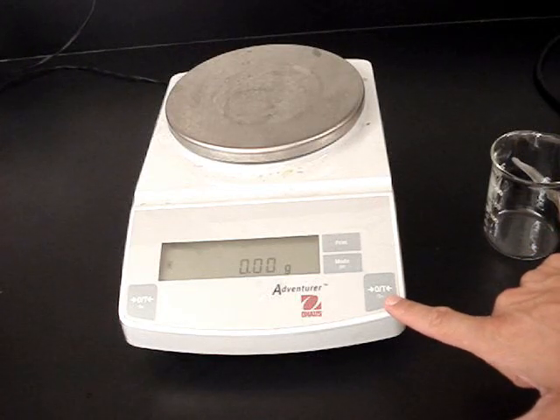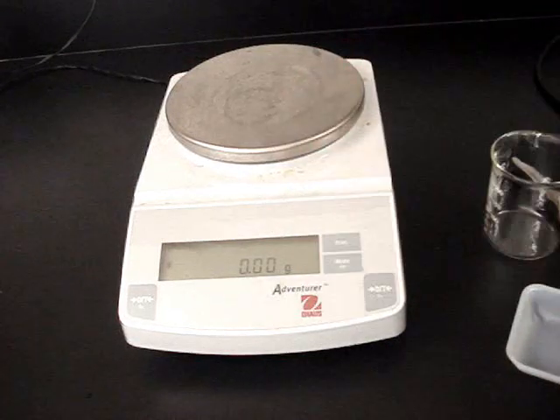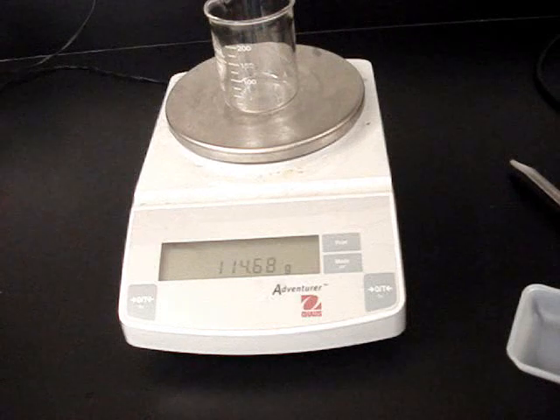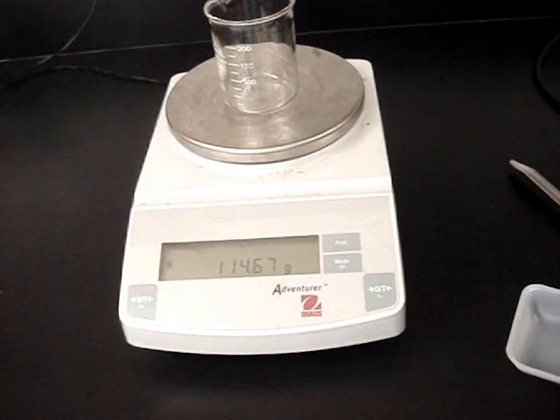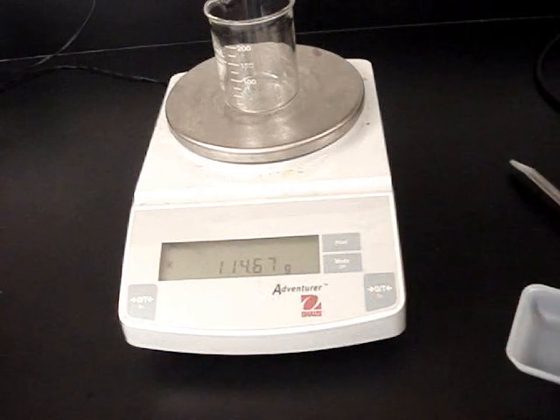And what it does, it basically subtracts whatever's on the balance. Right now you can see that the balance reads zero. If I put an object on the balance, such as this beaker, we can see that the mass has changed. If I hit the tare button, that subtracts it.